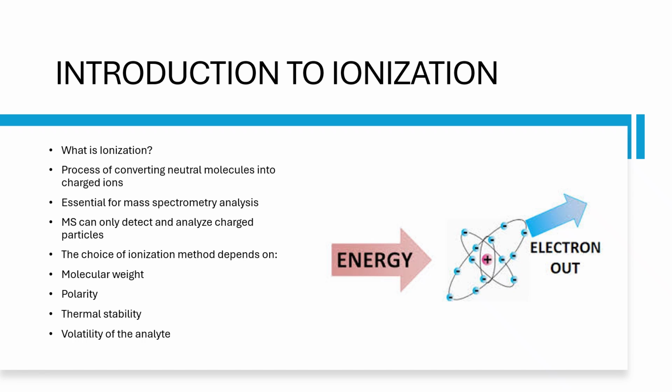Now, there isn't a one size fits all approach here. The ionization method you choose really depends on what you're working with. So you need to consider things like how big is your molecule? Is it polar or non-polar? Can it handle heat or will it fall apart? Is it volatile in nature? So all these factors play a role in deciding which technique to use.